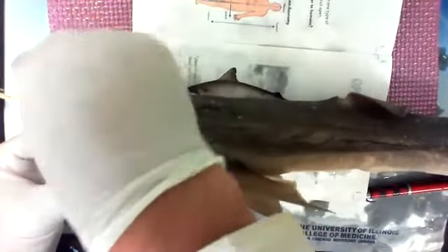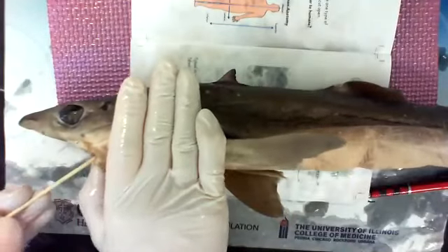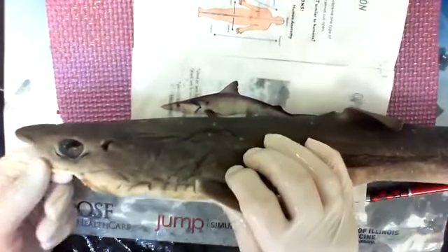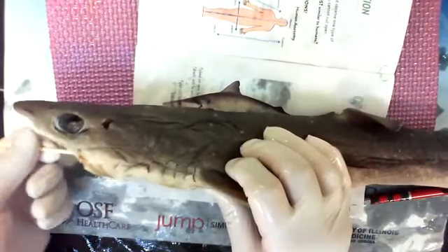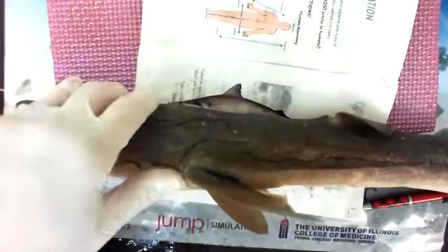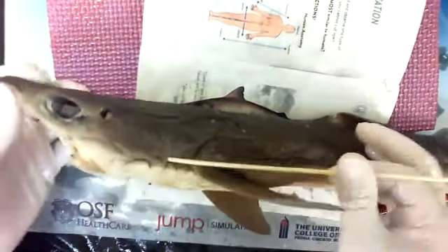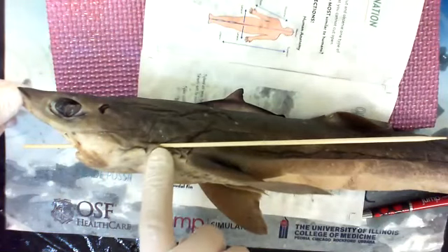This fish is kind of plump. So pull out a spiracle. How about go in here? Go into the mouth, and you're aiming for the gills. Wow. Mine's really rigor mortis-y. There we go. Put this in and kind of feel for the side. No, mine's too rigor mortis-y again. Guess we're gonna have to cut it open. Dang, huh? Well, I can see it trying to poke out here, but yeah, it's a little too firm. Let's see if I can go in the other way. So I'm going against the grain, kind of wiggling in. There we go. So you can see that pathway goes straight from the mouth. So water flows in, goes to the back of the mouth, and goes out the gills.